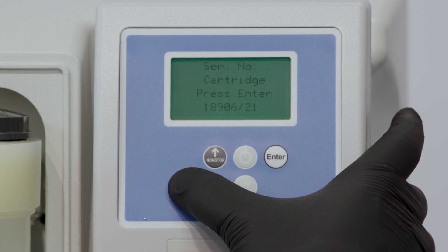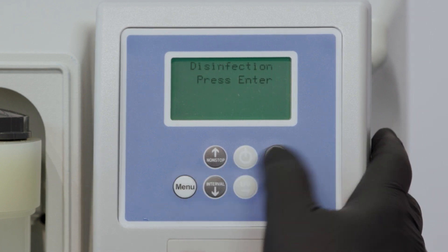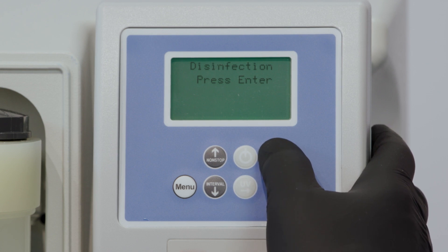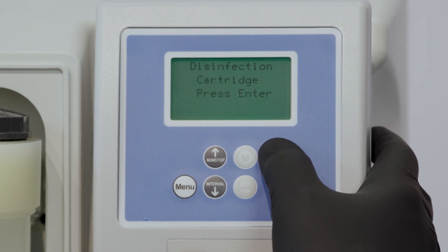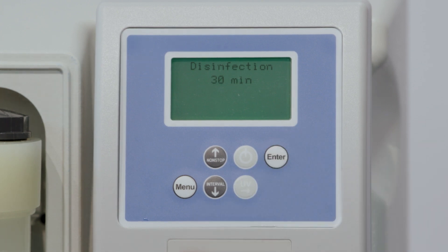Push the menu button until the word disinfection appears on the display, then press the enter button. Confirm that the disinfection cartridge has been installed by pushing the enter button again. This will begin the disinfection program, which takes approximately 30 minutes.